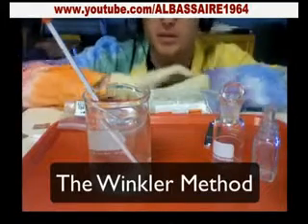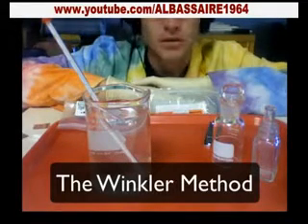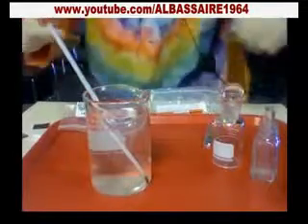It's kind of nasty, so you want to make sure that you've got a lab coat, goggles, and rubber gloves as well. My head is about to disappear, but my hands are going to talk you through the whole process. So to start, you've got to get some water.